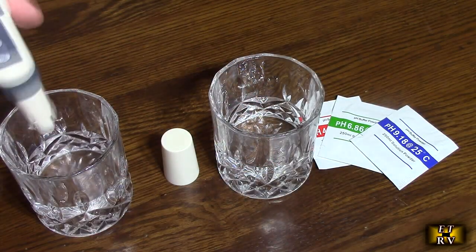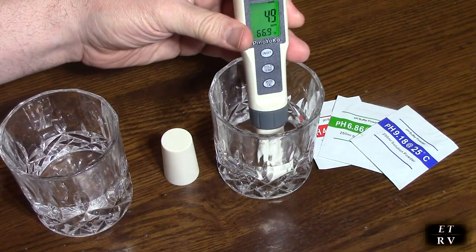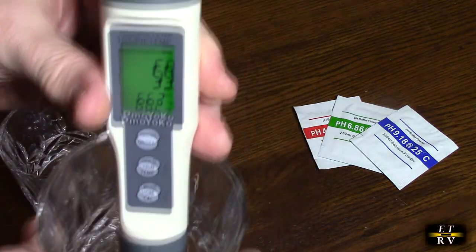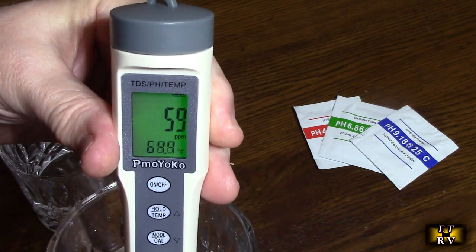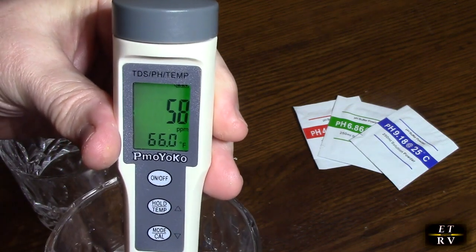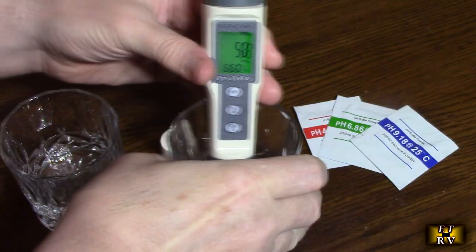Now let's take this out, let's shake it a little bit, let's put it in the filtered water right here. And that's showing me 60 parts per million. So that's the filtered water, and you can see it has a lower parts per million count.